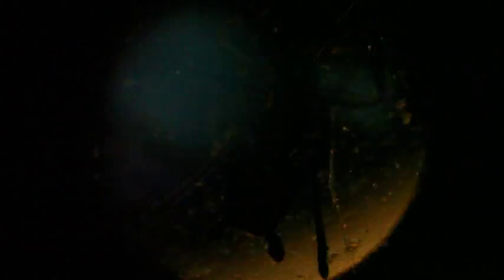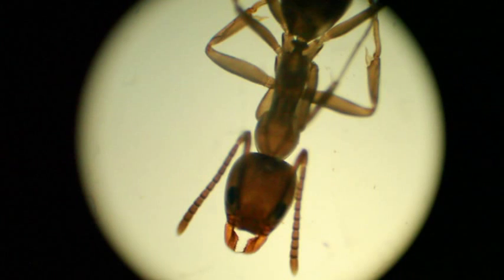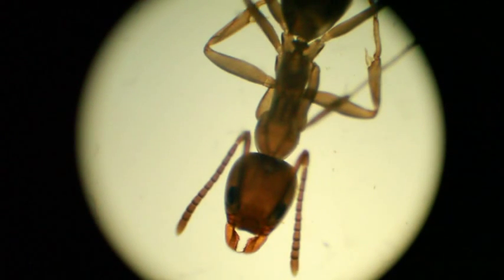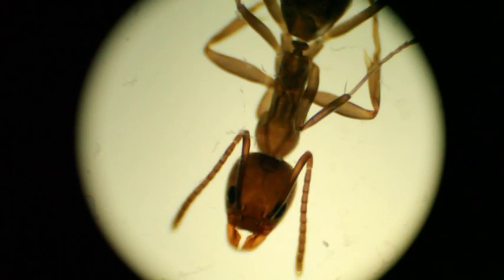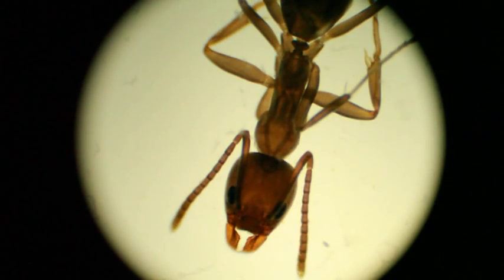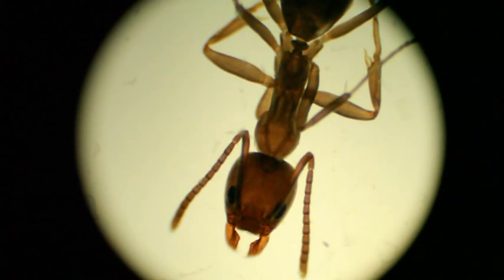Alright, that looks a lot better. Do you guys want to see the ant now? No. Good? No. Jared? No. It's still moving, it's about to die. You guys have to watch it now. Or not watch it ever again.